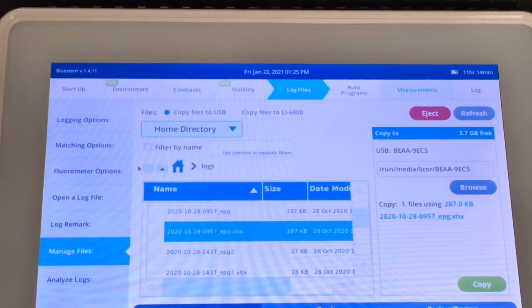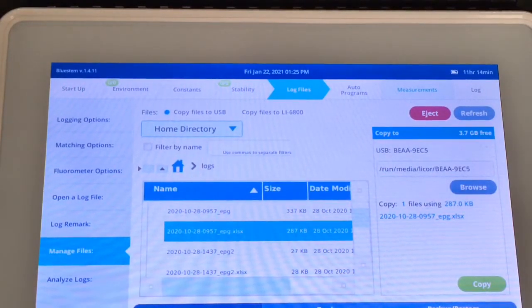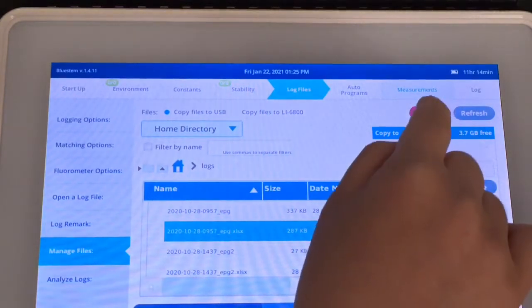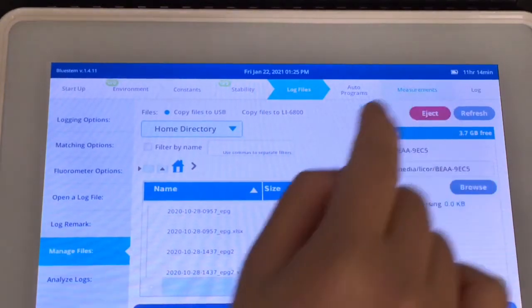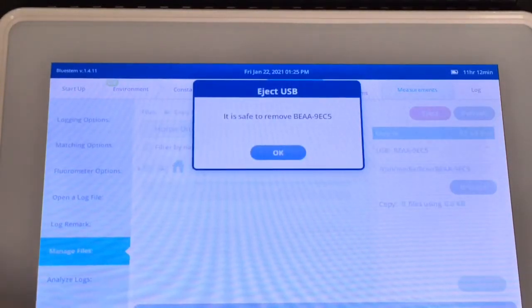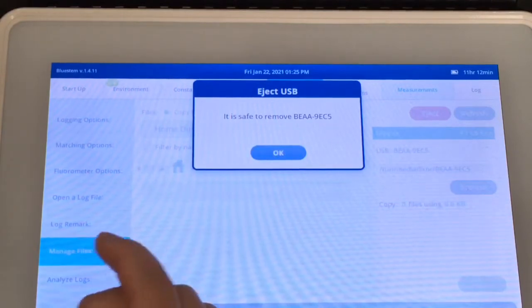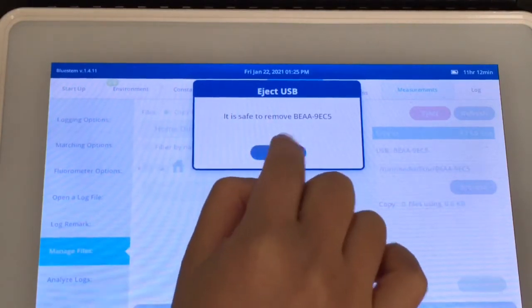To remove the USB storage device, we will suggest you to press the eject button, and then the USB drive will be safely removed.